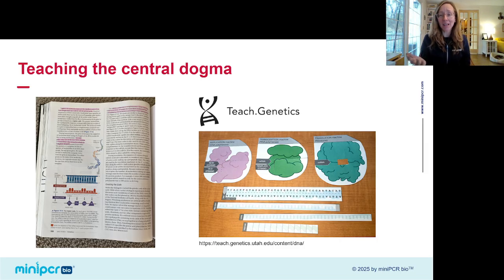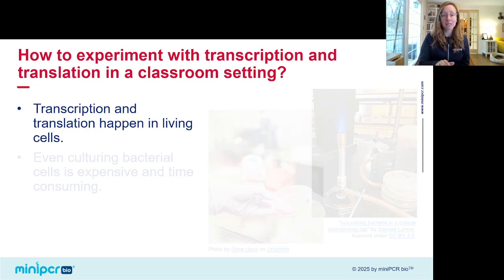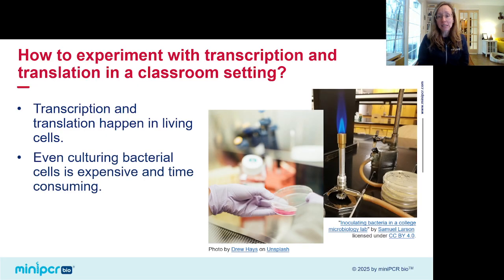But in a science classroom, the best thing would be to use science practices to investigate the central dogma. But why isn't there already a best-selling lab on transcription and translation? Well, these are processes that happen in living cells, and keeping cells alive is expensive and time consuming. So for teachers who are often working with very limited time and limited budgets, bacterial culture is just a bridge too far. It's too much of an investment to pay off.